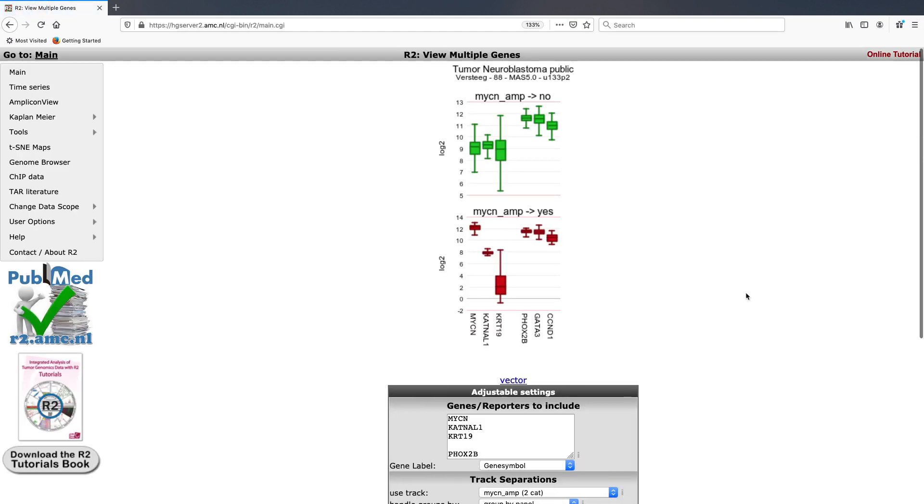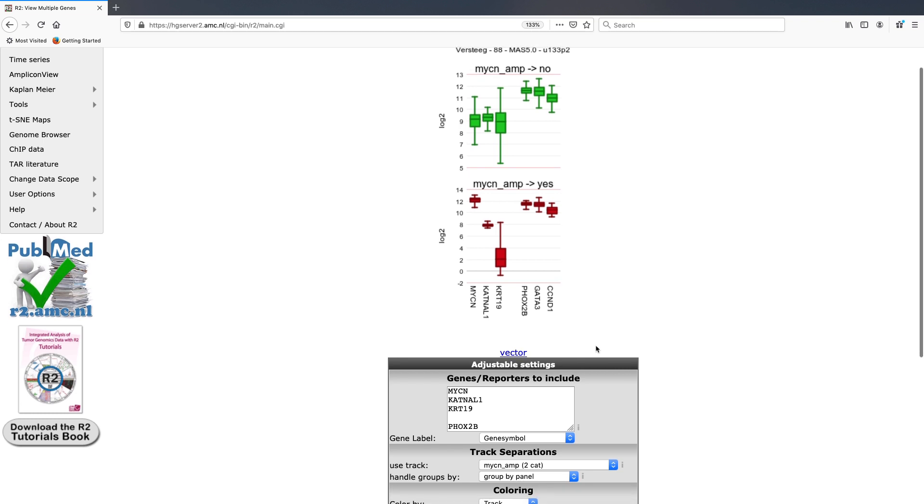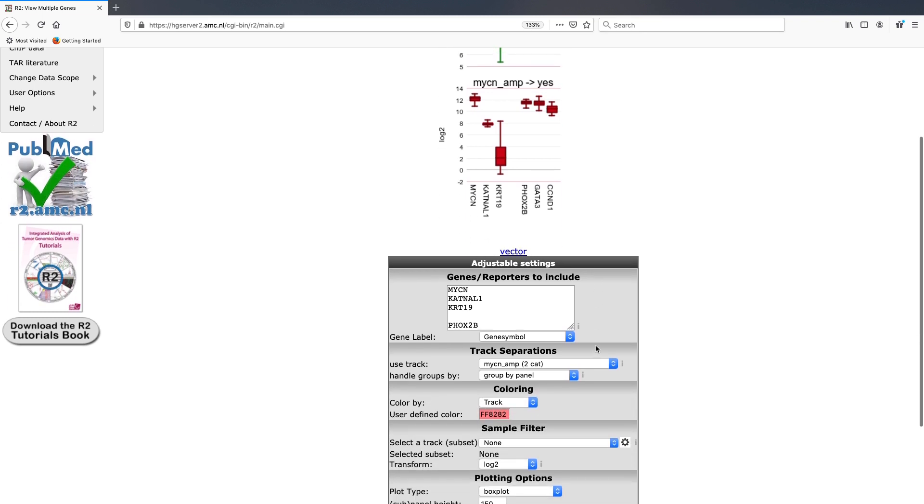Here you can see that we have now split up our genes of interest into both the non-MYCN amplified panel and the MYCN amplified panel. There are different views for this.